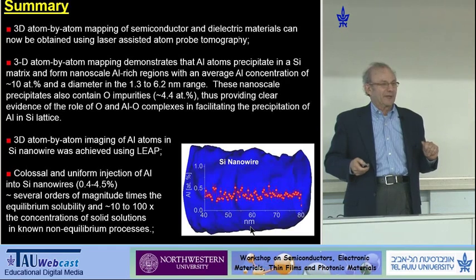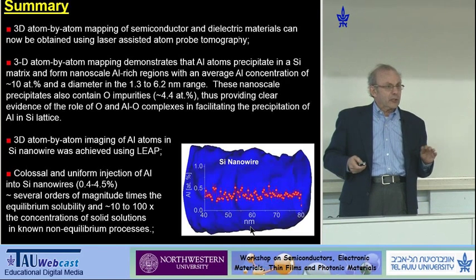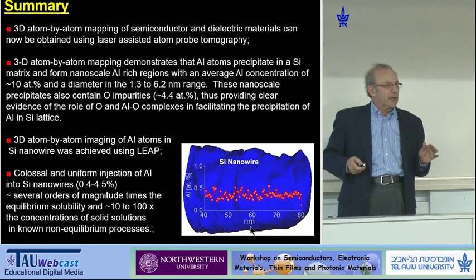This is the last slide, very good. It's much smaller than what we measure, so everything that we're seeing is a kinetic effect. It's not a thermodynamic effect. These are not equilibrium thermodynamic values, but these are kinetic values.